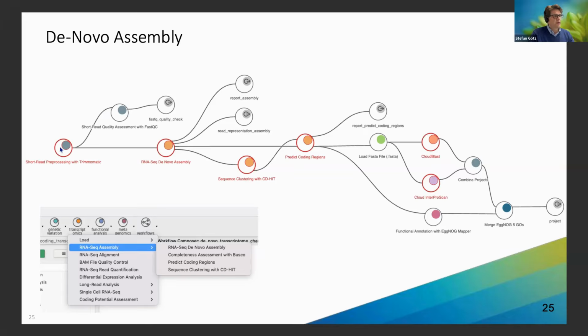And then you can do these pre-processing steps. So then you do de novo assembly. That's basically Trinity, Butterfly, Inchworm, and this kind of algorithms which you can run on your data. You get your transcripts. Remember, you're always getting a lot. So you have to do clustering, you have to predict coding regions, and then you have to go into your classification of transcripts, basically by doing blasts and filtering and annotation and those kind of things. We will see in a second.